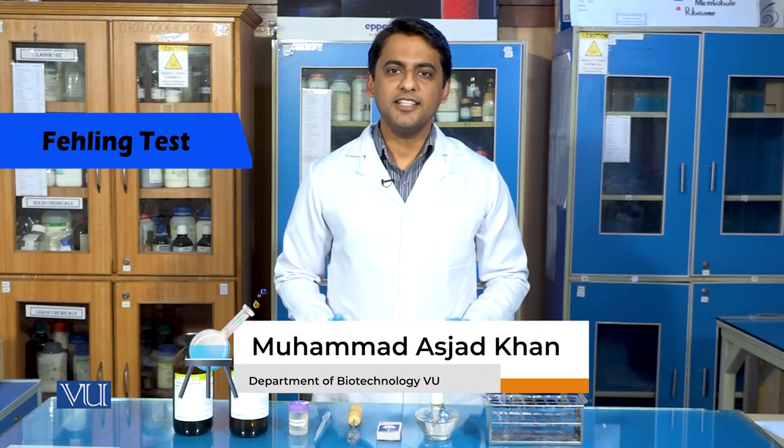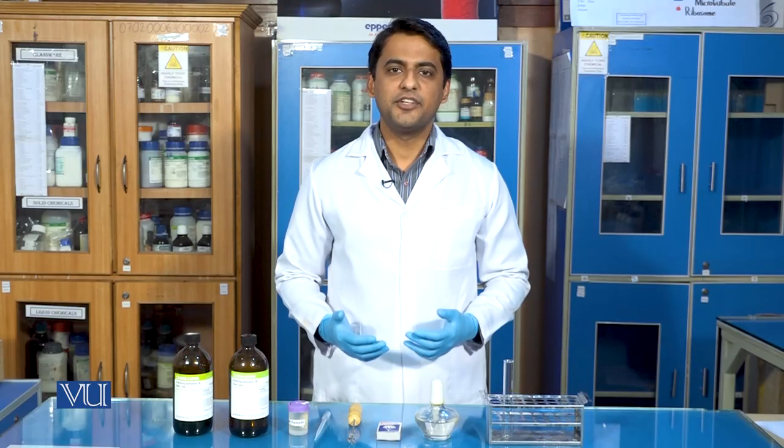Dear student, today we will perform fehling test. Fehling test is basically performed for the estimation of glucose present in urine. So let's start with the experiment.